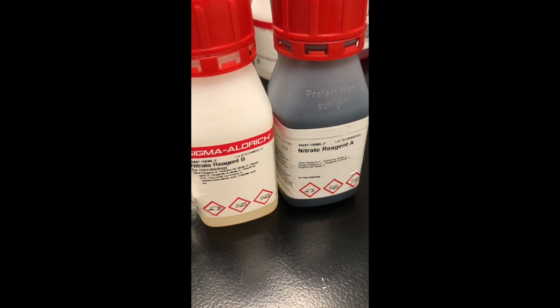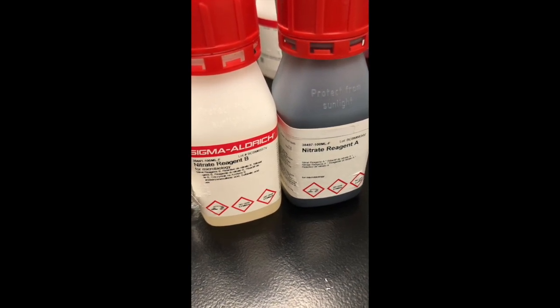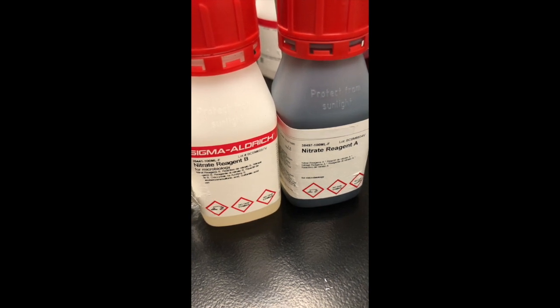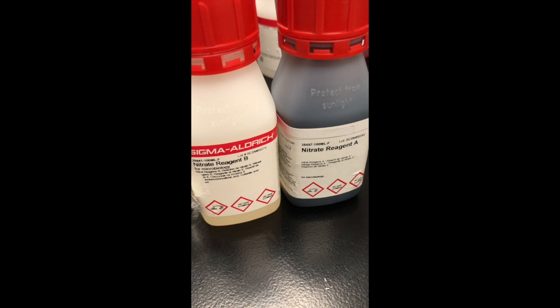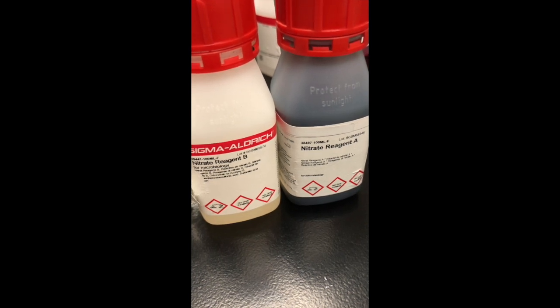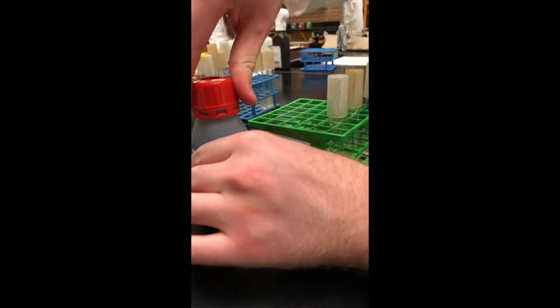Now we're going to start the nitrate test. We have sulfanilic acid and alpha-naphthylamine. Our bottles labeled them nitrate A and nitrate B. So we're going to add 5 drops of each reagent, starting with nitrate A, to each of our tubes, and then we're just going to let them sit for 10 minutes.